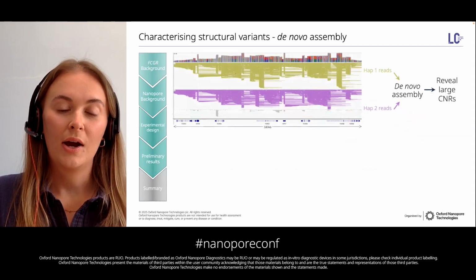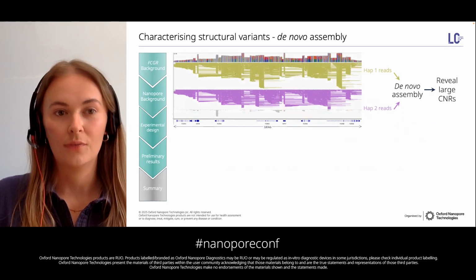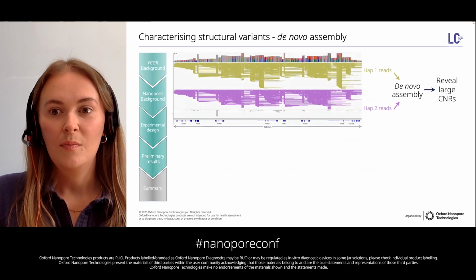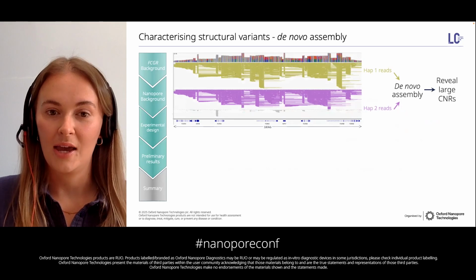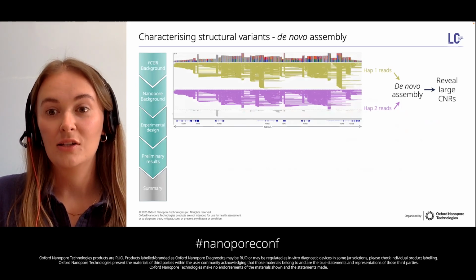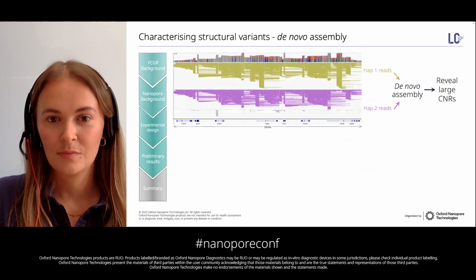So we've been working to optimize the assembly process for this homologous region so that we can now move beyond relying on the structure of the current HG38 reference, which conceals the CNRs. But this is proving difficult for some cases with complex variants depending on which assembler or parameters are used, as a lot of them aren't well suited to deal with these large nested repeats.